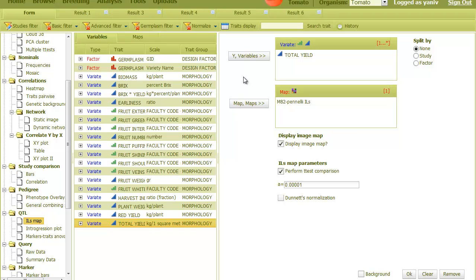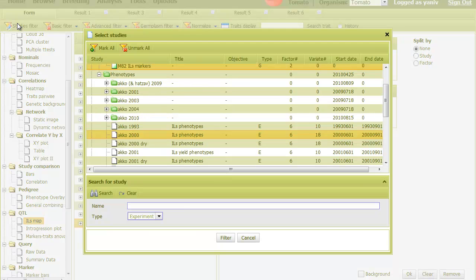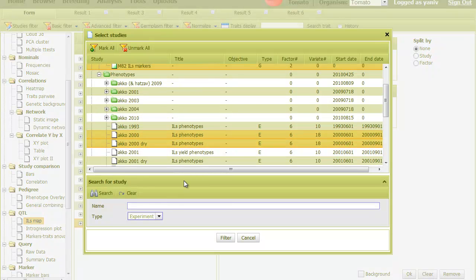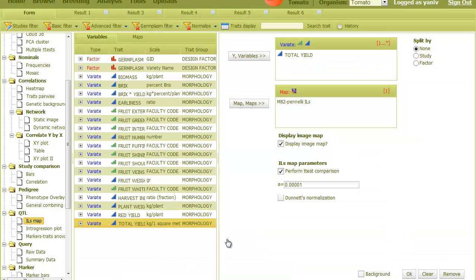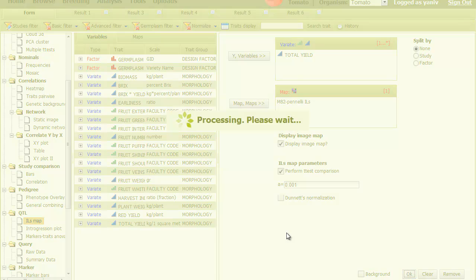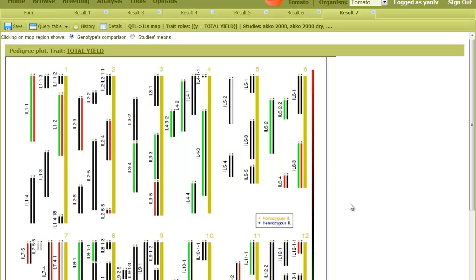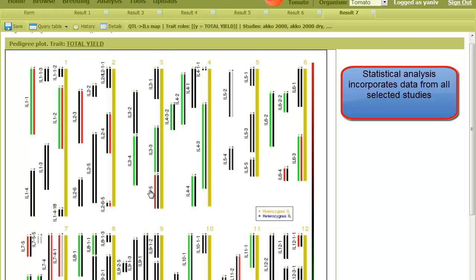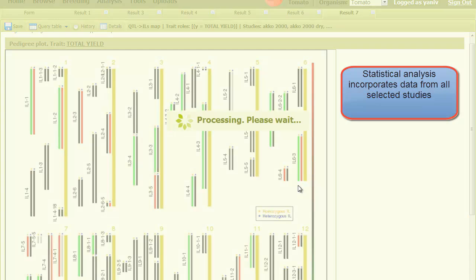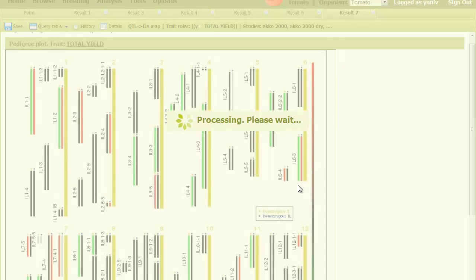In the form tab, I can select more phenotypic studies to be included in the analysis. Here I select another study where the trait total yield was measured. The resulting figure is based on the unified data from the selected studies. When I click on a line, I can see all replicates from these studies.